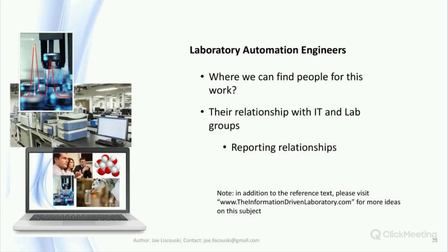I've been referring to the professionals that would be doing laboratory technology management and planning as laboratory automation engineers. The title fits the work. They work as engineers that help design, implement, manage, and support laboratory systems that fulfill an automation function. The automation aspect results from the optimization of laboratory processes through a variety of technologies that include instrumentation, robotics, and data systems. So, who might they report to, and where do you find them?